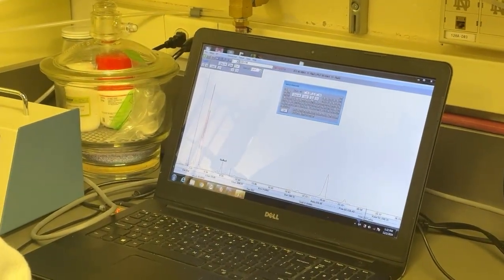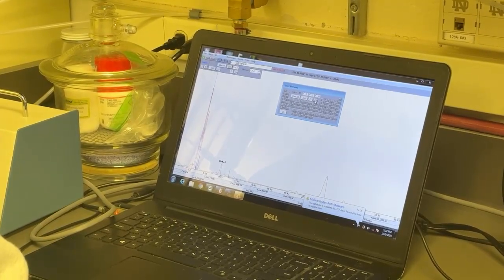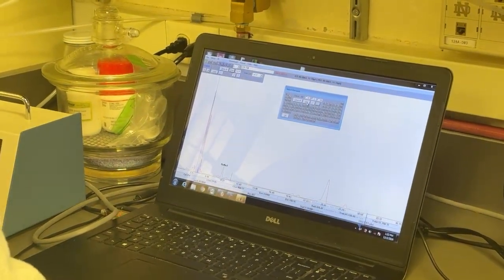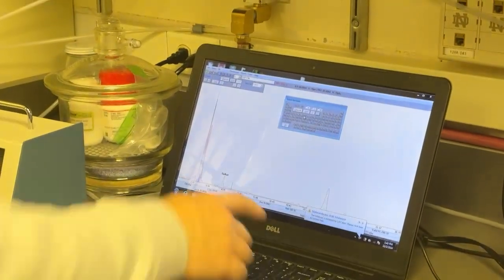So then we will search the other peaks. Right, so we're also looking. This one is tin. Okay, I thought you were going to say lead. No, not lead. Okay, good. Tin. There is no lead, so that should be here.